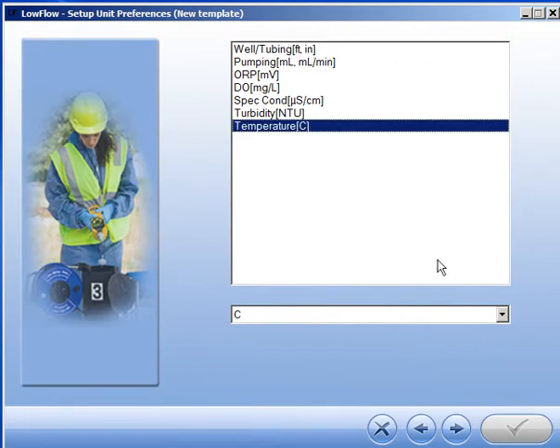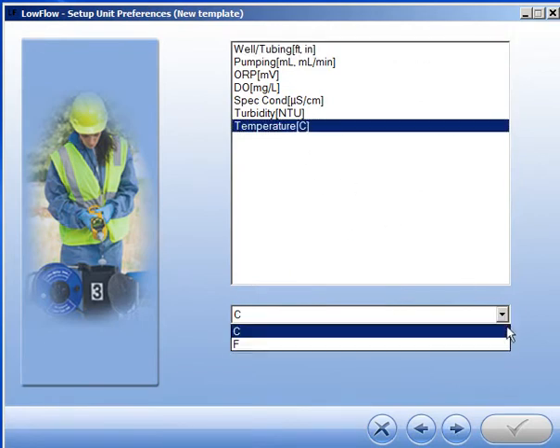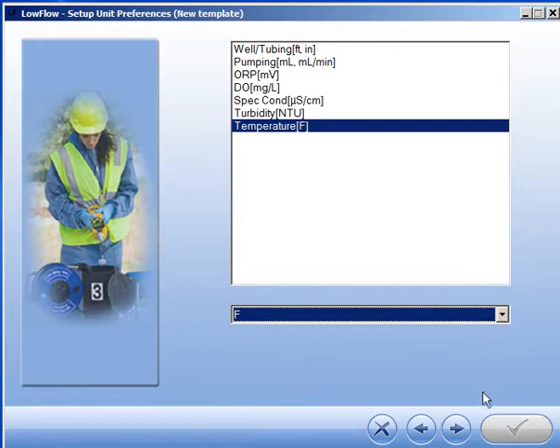This is where you can change your unit preferences, or you can leave the default values.